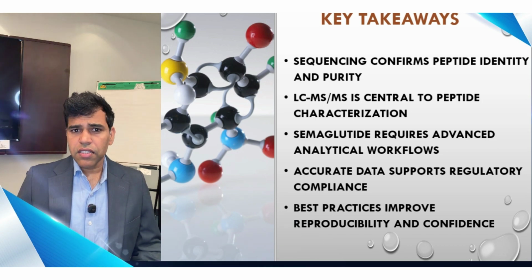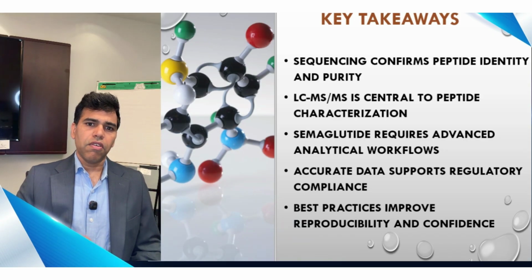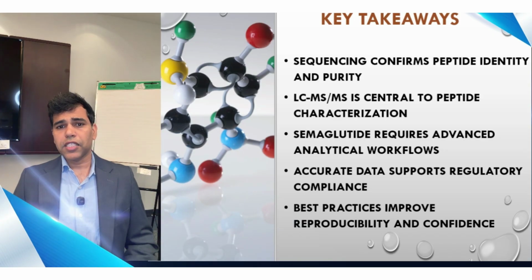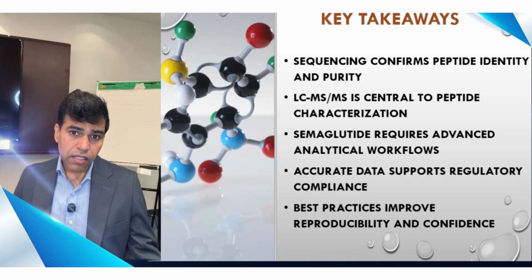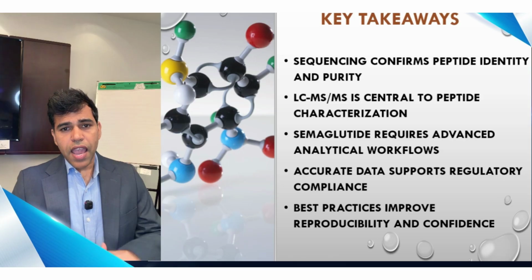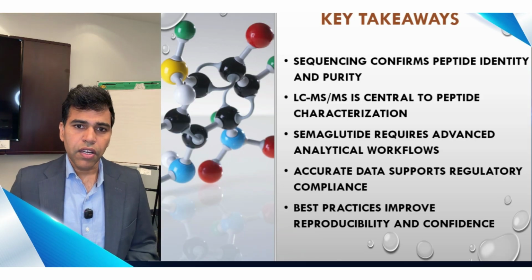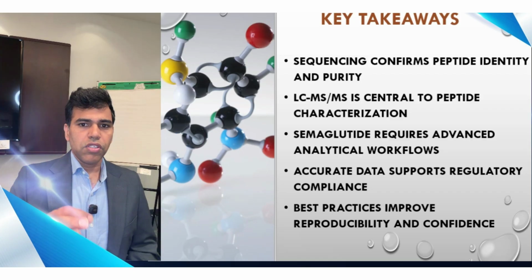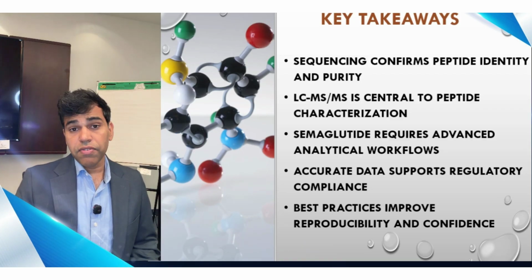LC-MS designed and executed correctly is the analytical backbone of characterization for complex modified peptides. And for a molecule like semaglutide, accurate sequence data isn't just scientifically valuable, it's what supports regulatory submissions with a kind of confidence that survives an FDA query.